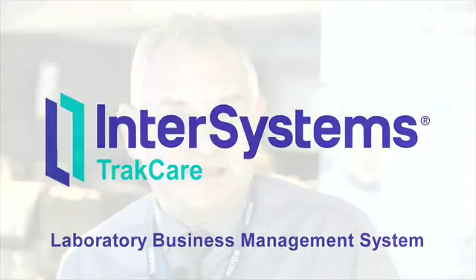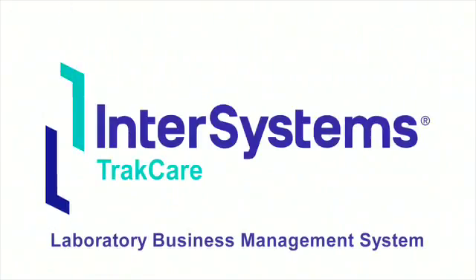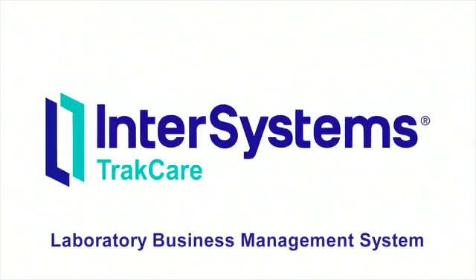The interoperability aspects of InterSystems, if we could get external hospital systems to message us that samples were on their way, I think that would be great, because we'd then have an expectation, a bit of forward planning as to the resources we might need to use in the lab to carry out the work. It's around providing quality information quickly.